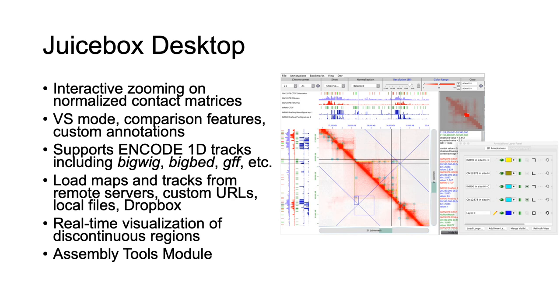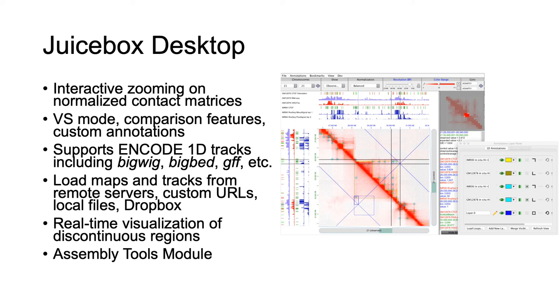There are two different flavors of JuiceBox, JuiceBox Desktop and JuiceBox on the Web. We won't go through the tutorial on JuiceBox Desktop, but I encourage you to explore the features on your own. Features special to JuiceBox Desktop include versus mode, real-time visualization of discontinuous regions, and the assembly tools module.